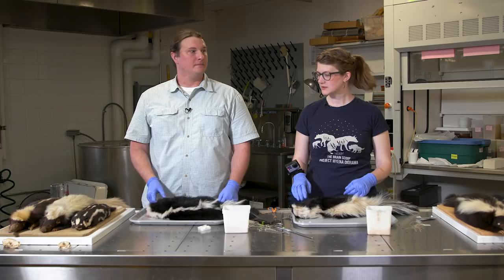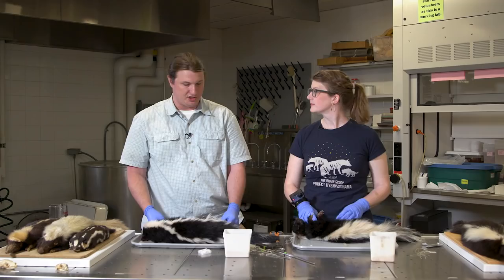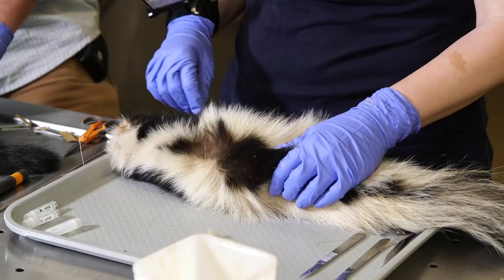Before we get cutting, we should introduce our characters. We have two individuals here. Even though they're called striped skunks, you can see they vary in their stripe patterns — but they're the same species, Mephitis mephitis, which comes from the Greek root meaning stinky or odor-smelling, which is what Mephitis stands for.